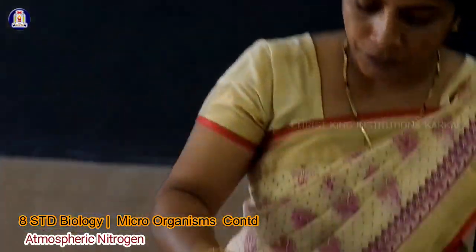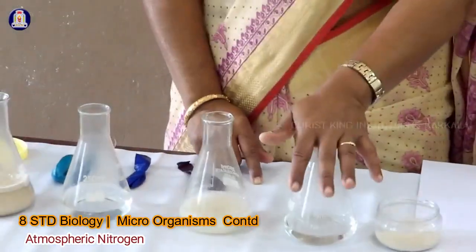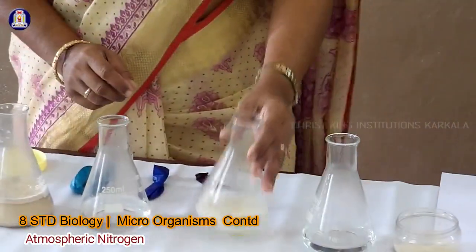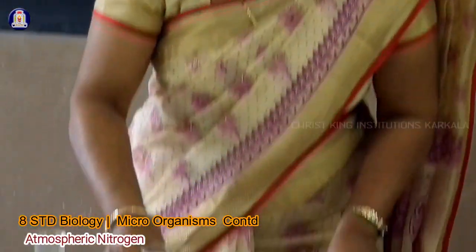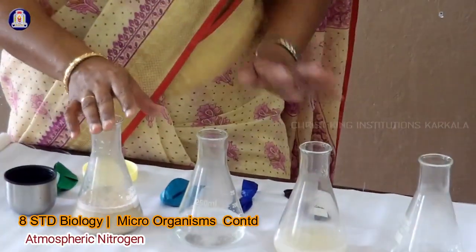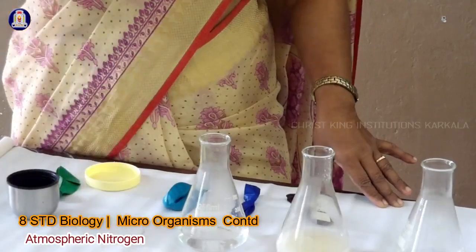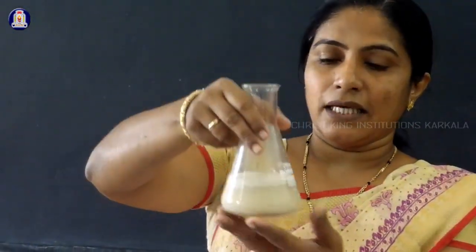Keep in your mind: the first beaker is just water, the second beaker is water with the yeast, the third beaker is sugar crystals with water, and the fourth one is very important. Now our result will come from that one, so we have to identify it. In this beaker I have already taken water, yeast and sugar. I will shake this beaker.